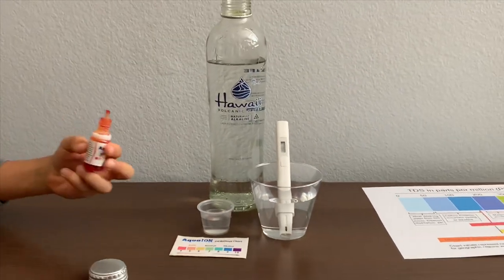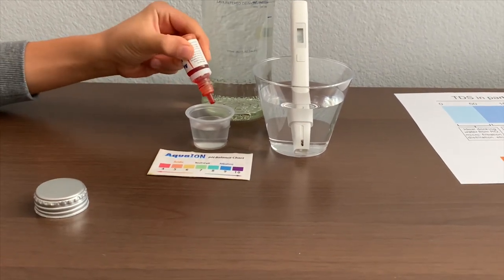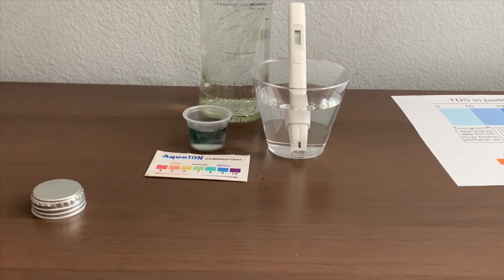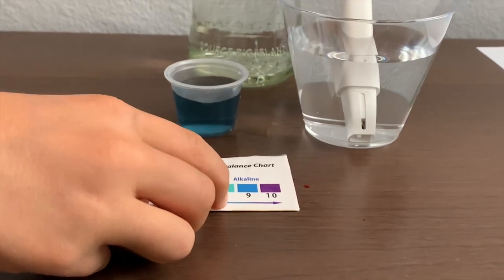Now let's test the pH level. If you want to buy this pH tester, check the link down below. Only do two drops. Let's stir it a little for a better result. I give this an 8.5 — this is alkaline water.